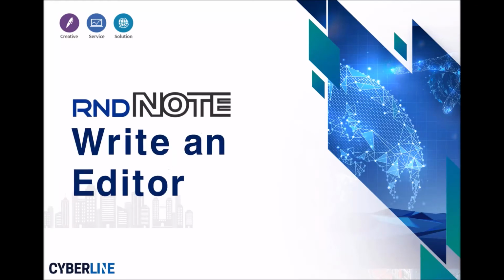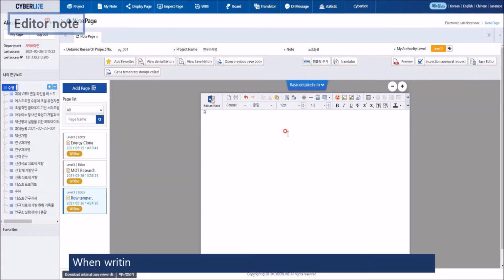I would like to introduce you how to use the editor. When writing an editor note, the writing area can be enlarged or reduced.